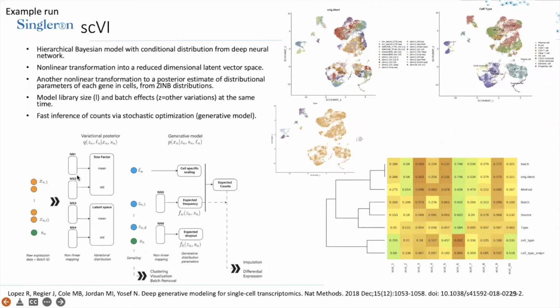In addition to batch correction, it has the capability to impute differential expression from the data. When we look at the batch correction results, scVI in this data set is a little bit conservative, and similarly to one of the earlier tools, the cells from different samples are still more or less away from each other.